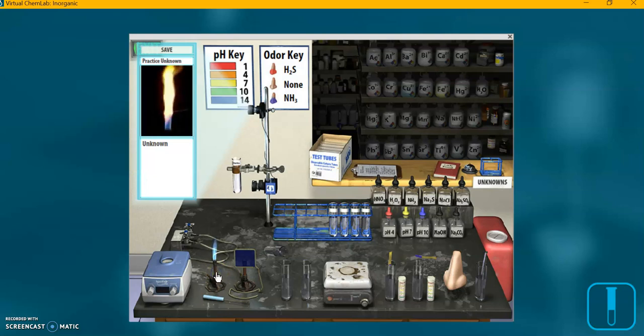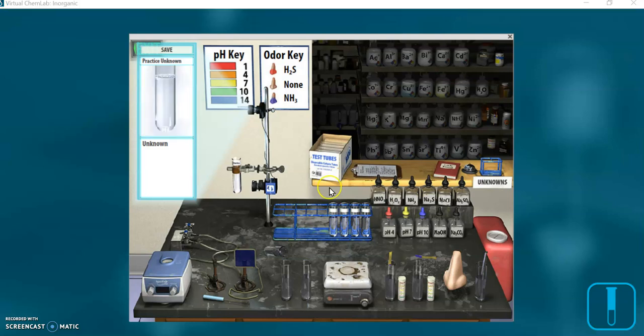This one definitely looks different than the last one. And the cobalt glass plate flame. Okay, make your guess as to the color, as to the chemicals which produce that color.